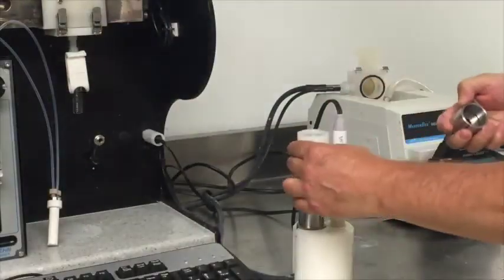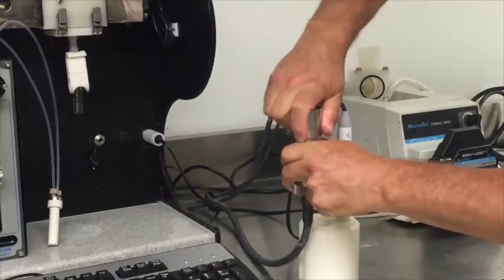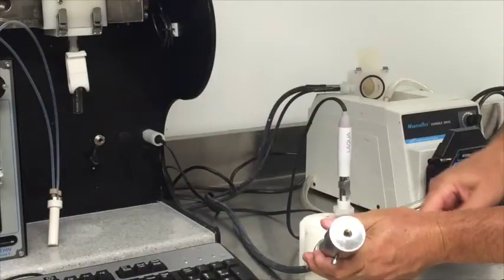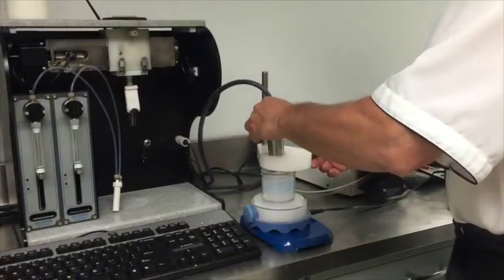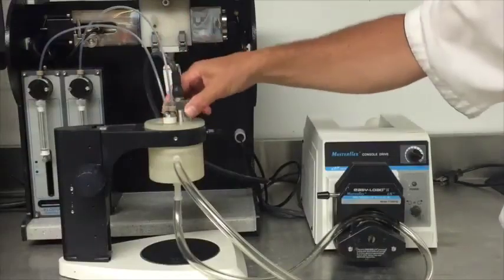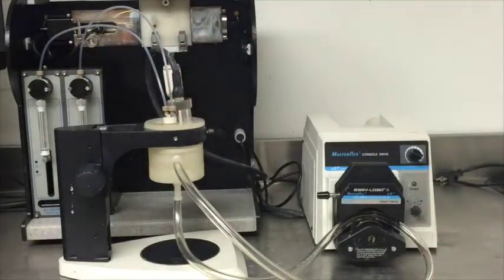Minimizing sample volume for the zeta potential probe can be achieved using these cups, which are placed on the face of the probe. Minimum sample volume is 0.1 milliliters in the case with the steel cup. The zeta potential probe can also be inserted into the sample in an external vessel, which can be stirred or not. We also have a special setup for the zeta potential probe for pumping sample through with a peristaltic pump. The injection probe for the titration burettes can be inserted into the sample as well, which would allow for conducting titrations of heavy viscous samples.